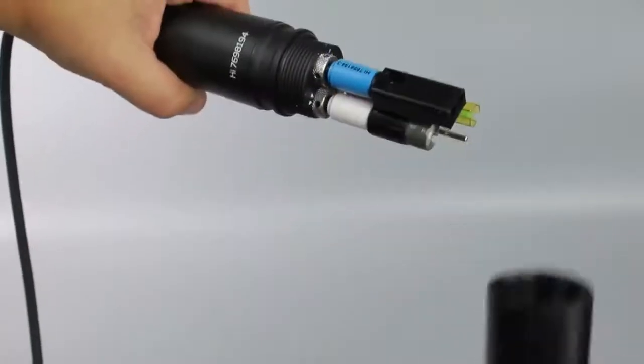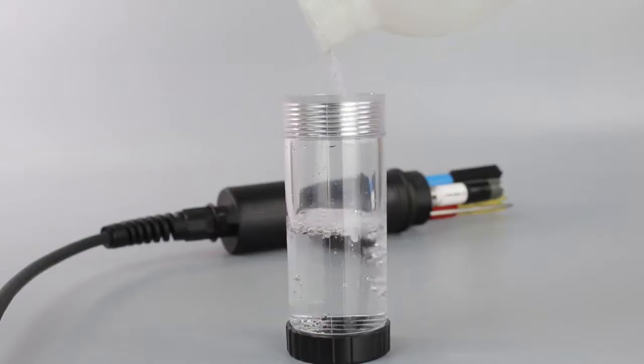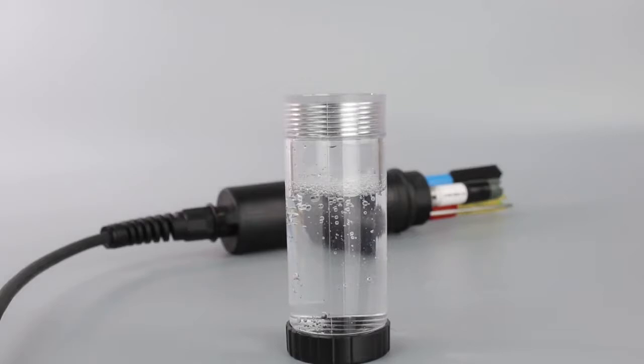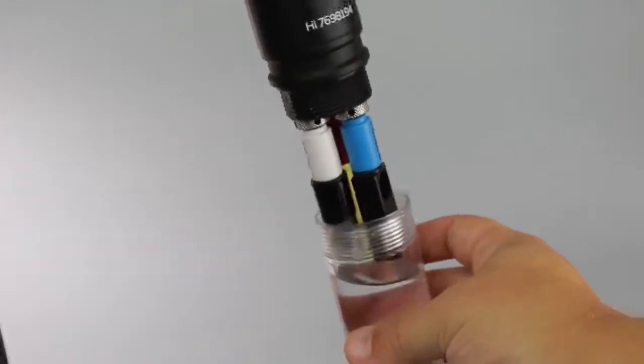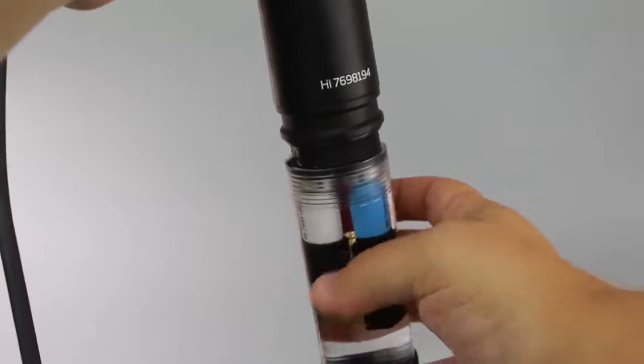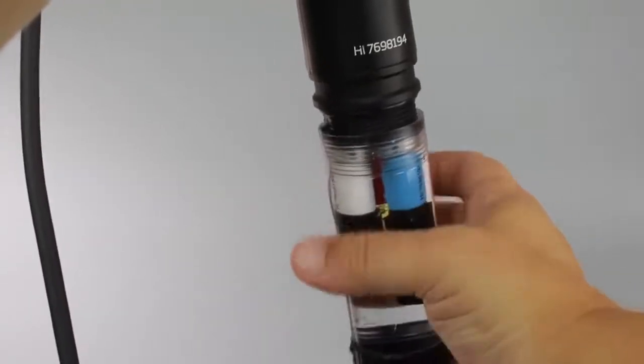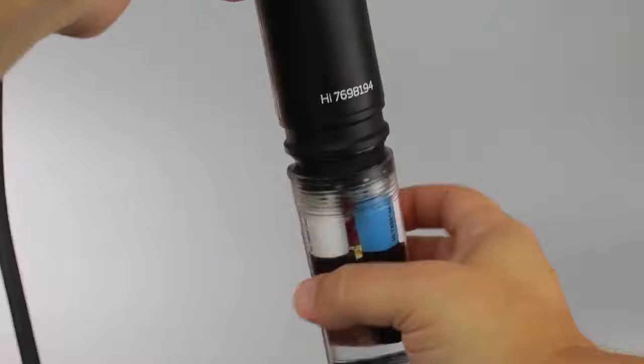To calibrate, remove the protective shield from the probe. Fill the supplied calibration beaker two-thirds of the way with your HI-9828 calibration solution. Submerge the sensors into the beaker and then screw the beaker onto the probe body. Don't worry if some solution overflows.